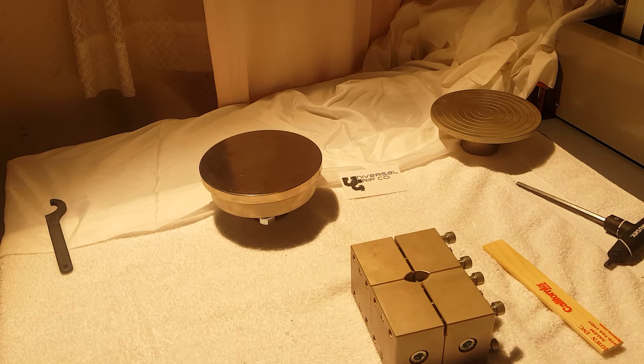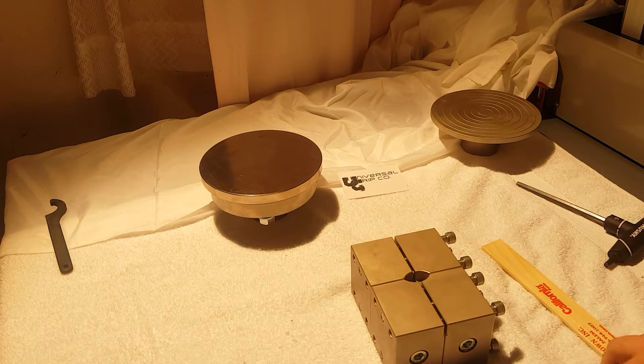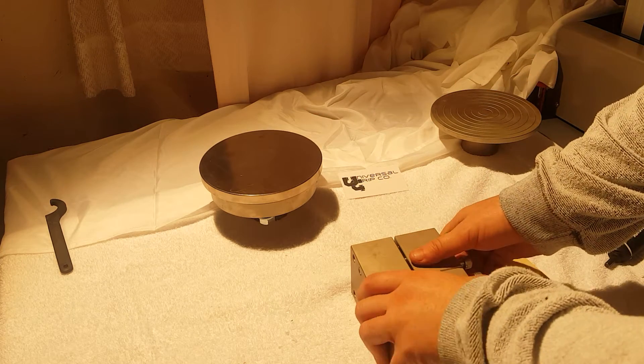I'm going to show how to use the fixture, how to set up a sample, and then how to load it in compression. We'll start with the fixture.